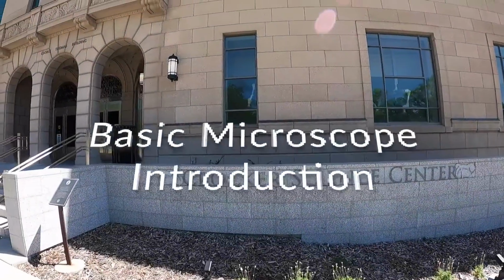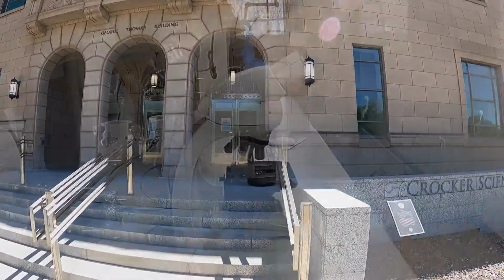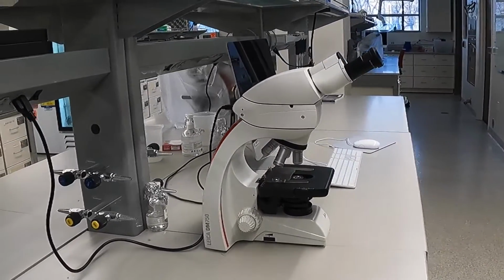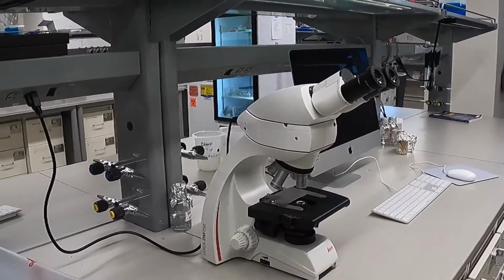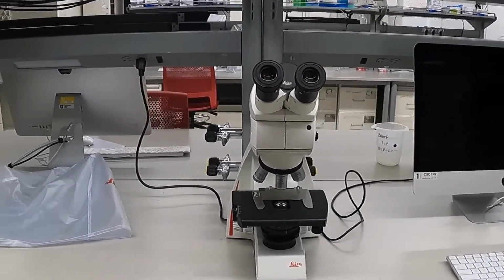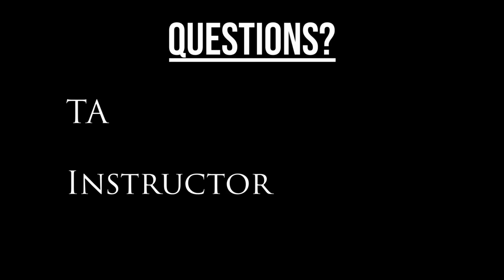In this video, we will be covering the basics of operating a microscope, including the parts of the microscope, the procedure for finding and focusing on a sample, how to change the objectives, and how to leave the microscope at the end of the lab so that it is ready for the next user. We'll also go over some general rules to keep in mind and some basic troubleshooting. If after watching this video you still have questions, be sure to ask your TA or instructor for clarifications.